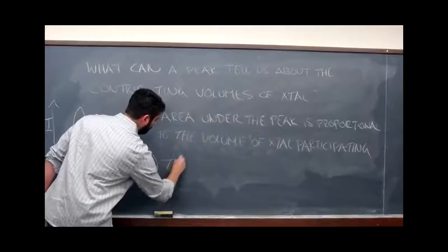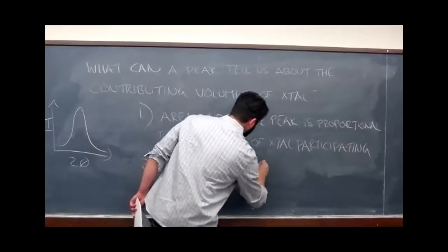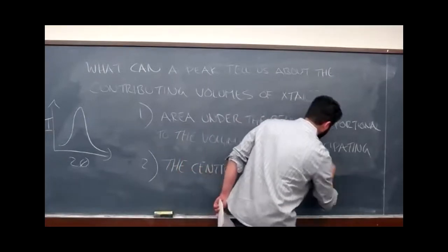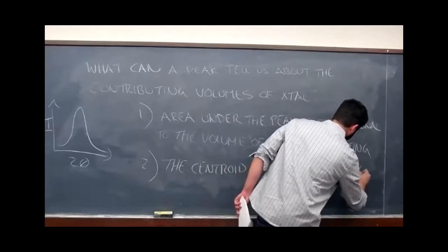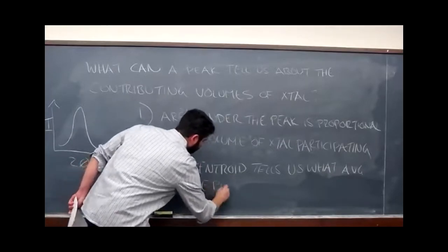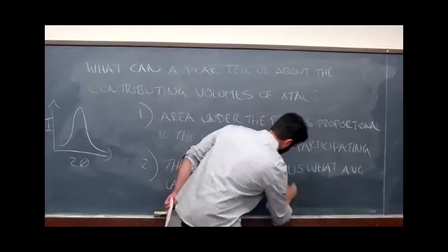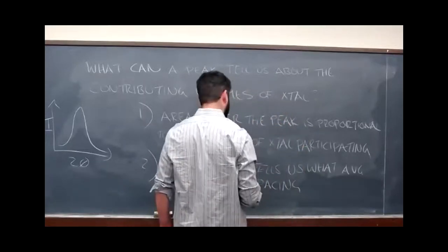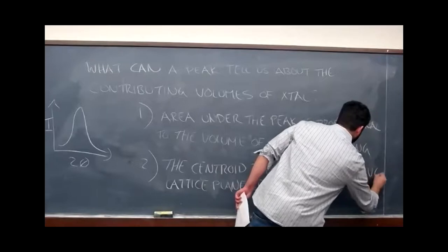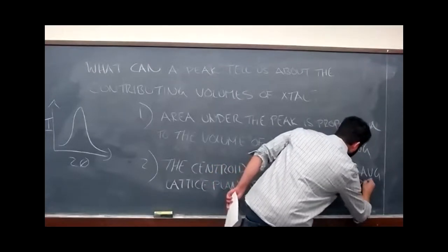Two, the centroid tells us what the average lattice plane spacing is in that set of crystals. And from that, we can figure out lattice strain.